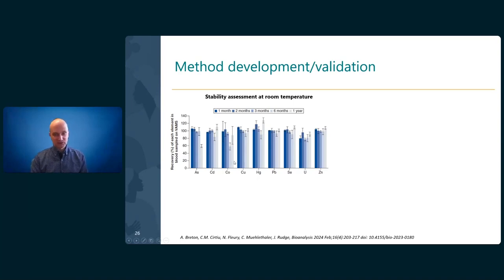And this is actually more related to the analytical aspects and not stability itself. Because with arsenic, we noticed that over time we might get a kind of contamination. All tests were run with a blank, and that blank has been subtracted.